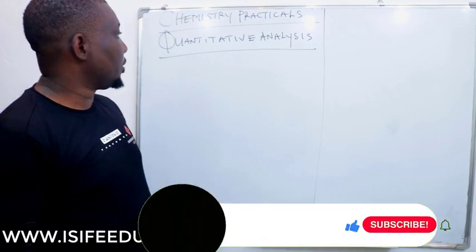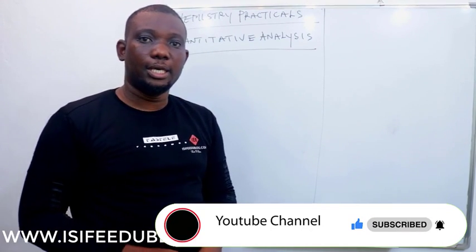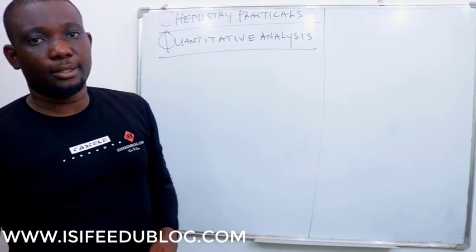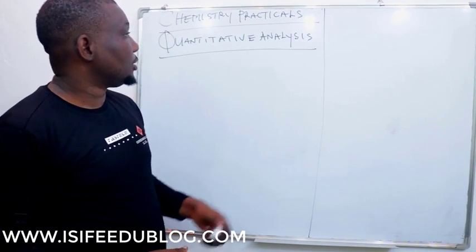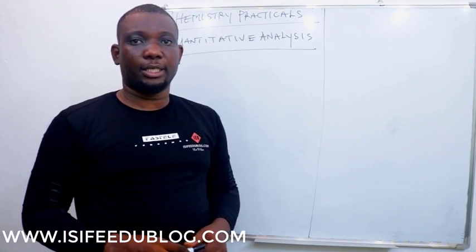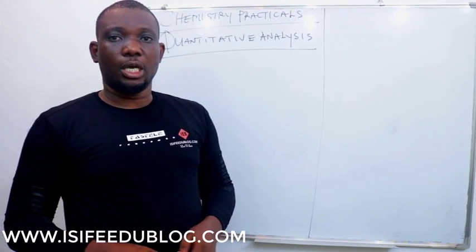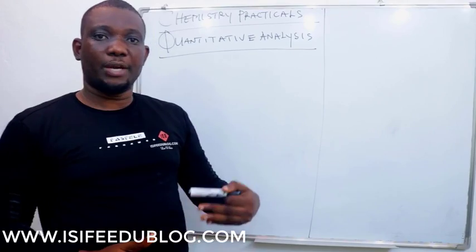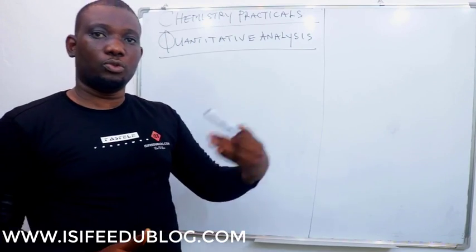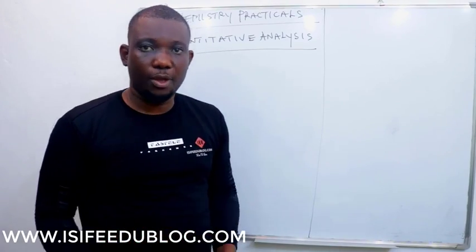So we're going to be looking at the quantitative analysis of this year's SSCE, basically WAEC. I'm going to be doing a lot of interpretation of the practical that is forthcoming. The practical is kind of a rare practical. It has to do with redox, reductometry and oxidometry titration. In my previous video, where we treated a redox reaction, I would like to refer you to that video once again for you to have an understanding of this aspect of titration.